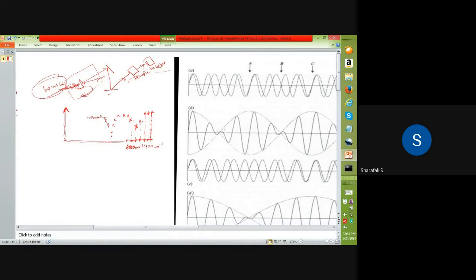So this is what we do in normal IR spectrometer. So we'll get the spectra for the transmittance. We'll use that percentage of transmittance. So this is the process. So in this case, how many number of points you will get? It depends on the resolution of your prism and your grating.